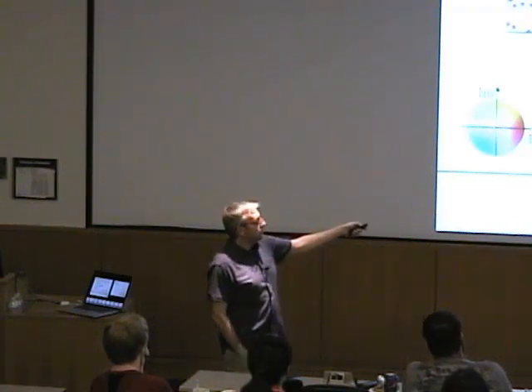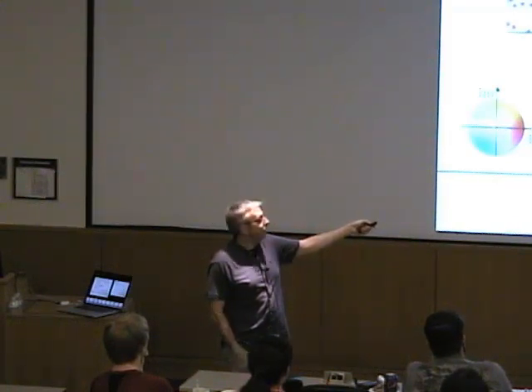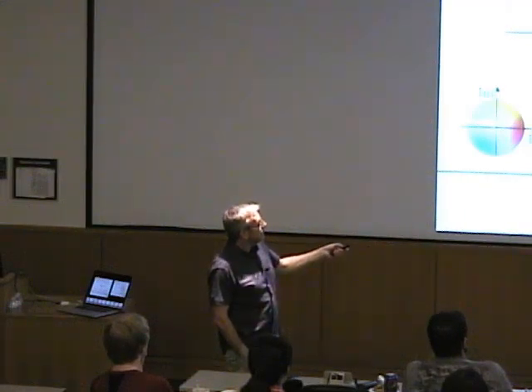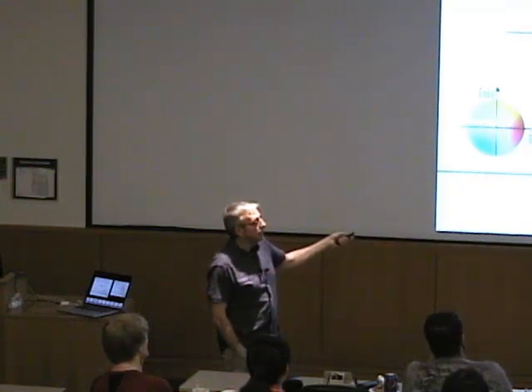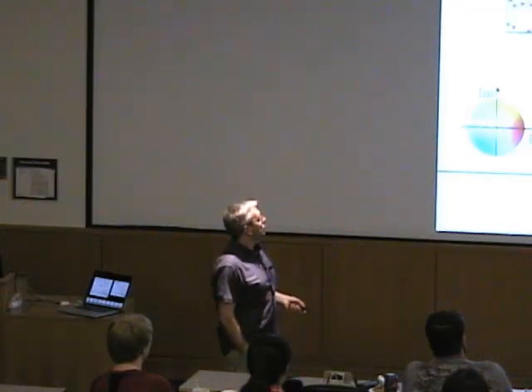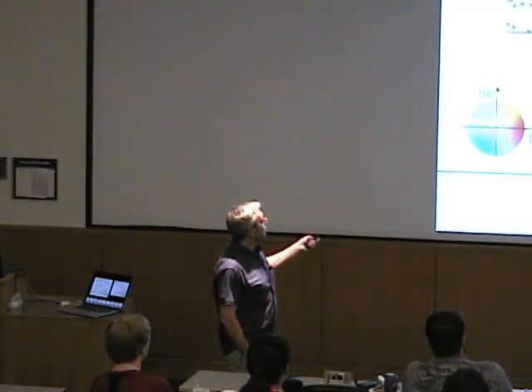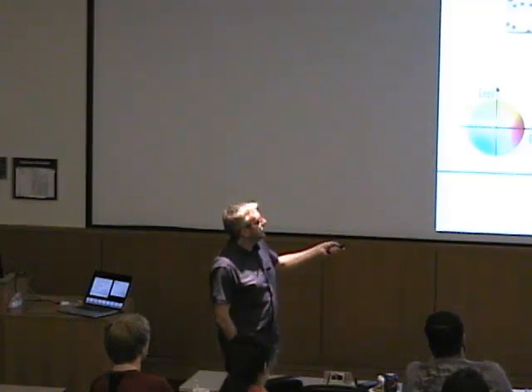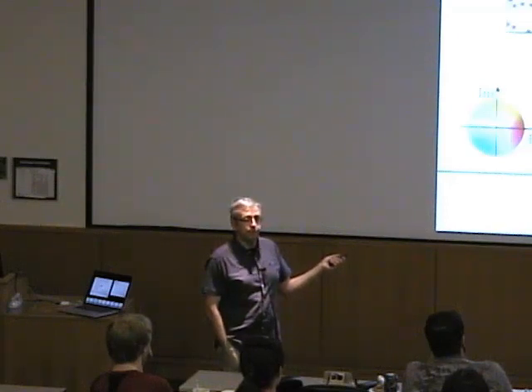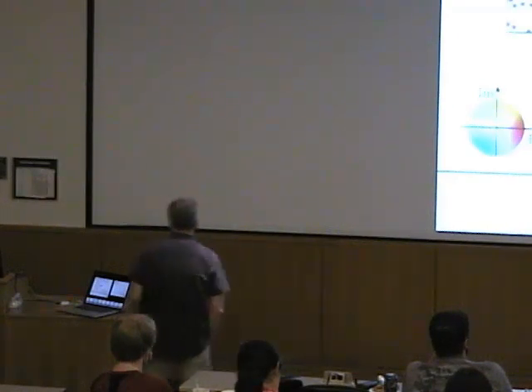then you get something like that. And then you are at a diffraction image. And if you go back to the single molecule, of course, then you see that all the information on the structure is still in there. That's why this works. What you don't see on this picture is that due to the fact that you have a lattice here, this is millionfold amplified to the point to make it detectable. That's why we're doing this.